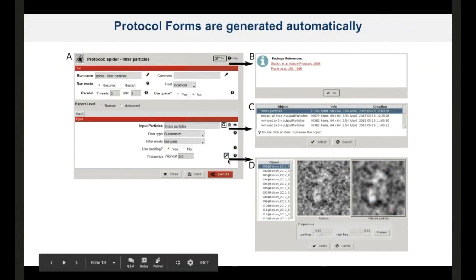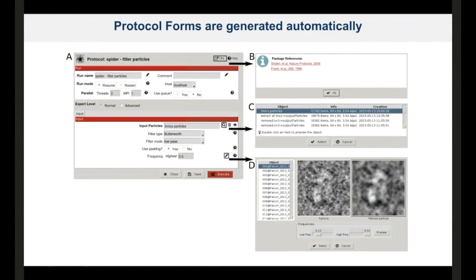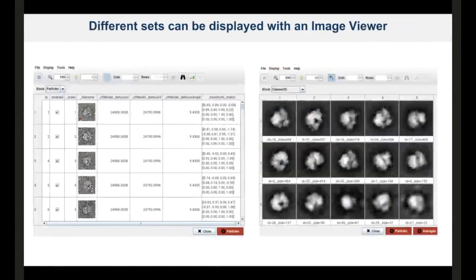And then we have also built in more handmade graphical interfaces that we call wizards. These wizards have the function to provide you a real-time preview of the operation. They are quite handy in some cases. For example, with this filter, you don't need to figure out in your mind how a frequency will affect your images. You can just change the parameter and see how this will affect them, or in some other cases like selecting a mask or CTF frequencies as well. This wizard needs to be done manually somehow, but you can reuse some components. So it's also kind of an adding tool for developers.